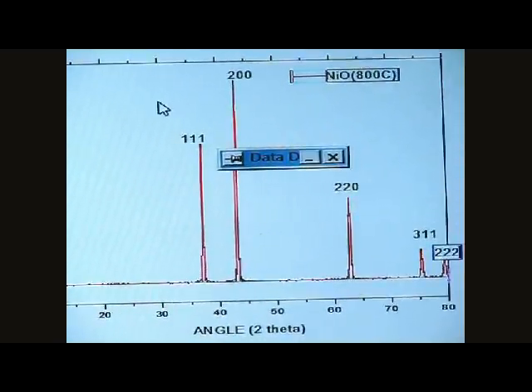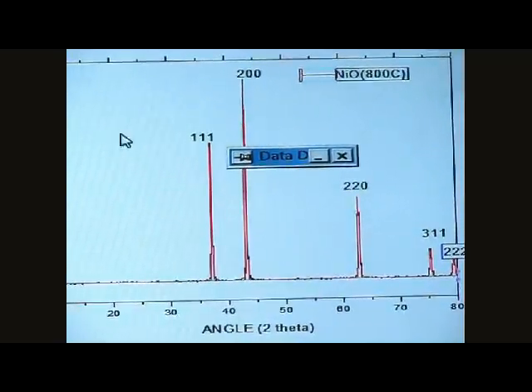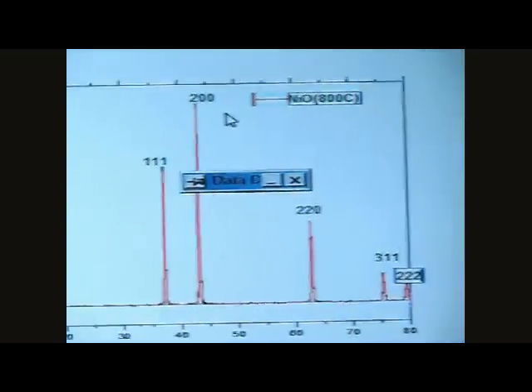That is, we mark the Miller indices on the corresponding peaks. We are plotting the given XRD data and marking the Miller indices.